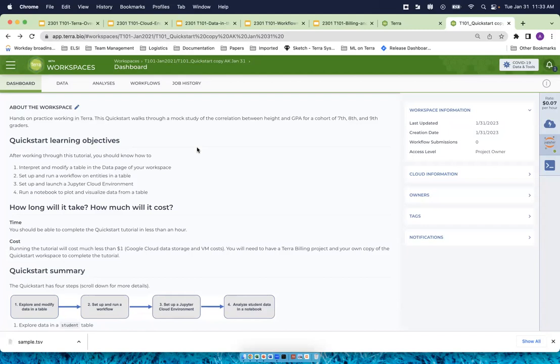My organization has GCP accounts, so we can create VMs at will and projects and whatever. You can use your Google account for billing. That's fine. If you have an existing Google account, you can set a Terra billing project under that account, but no, you can't replicate, or sorry, replicate isn't the right word. You can't use your VM from Terra. Okay. Yeah. All right. Thank you. That answers my question.